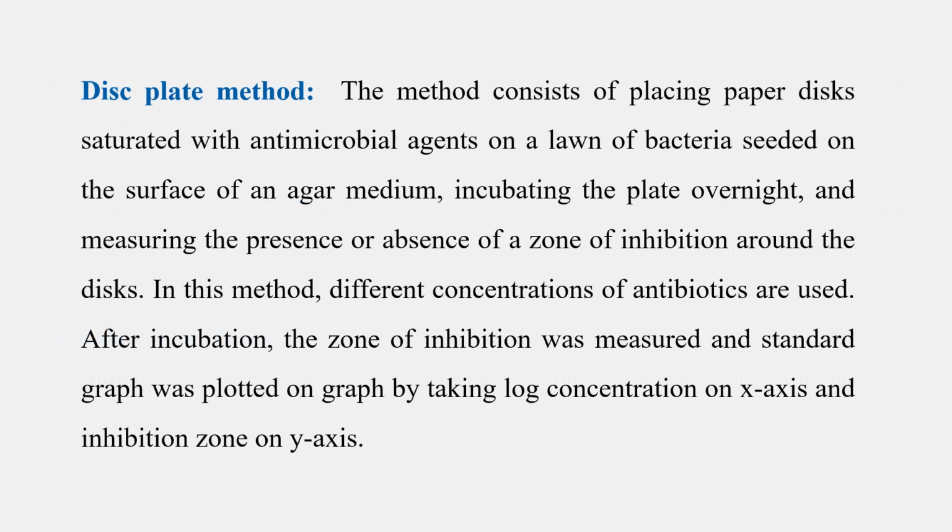Next is the disc plate method. The method consists of placing paper discs saturated with antimicrobial agents on a lawn of bacteria seeded on the surface of an agar medium, incubating the plate overnight, and measuring the presence or absence of a zone of inhibition around the discs.